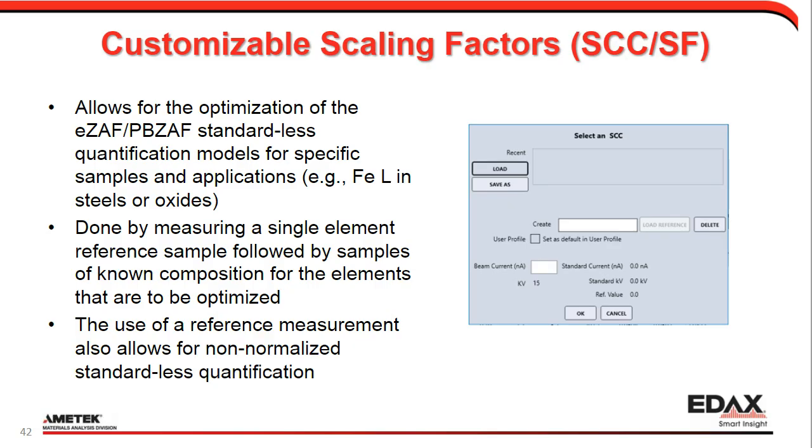To summarize the benefit of SCC and SF factors, first of all, it optimizes the calculation in the model to get the right results for specific samples and applications. And secondly, you can do quant non-normalized without standards.